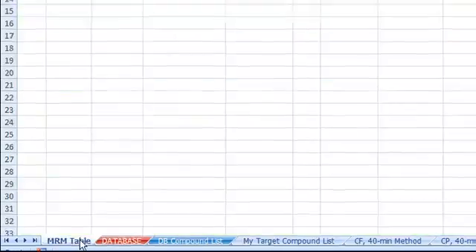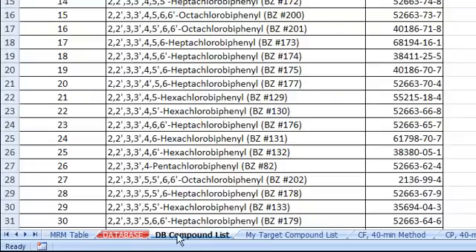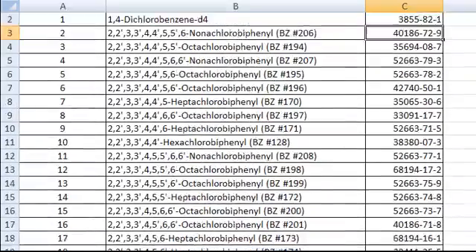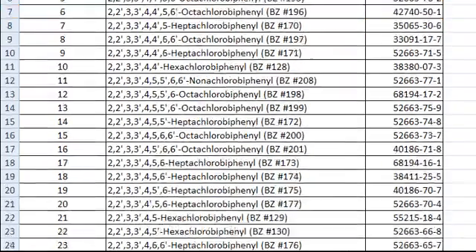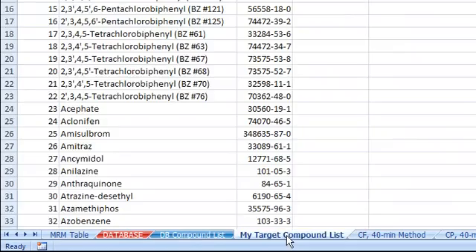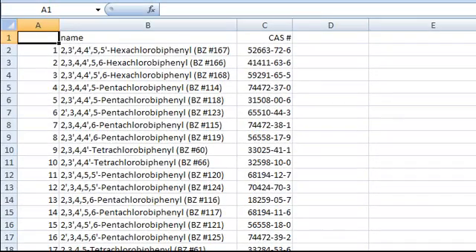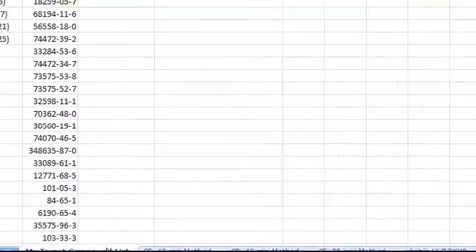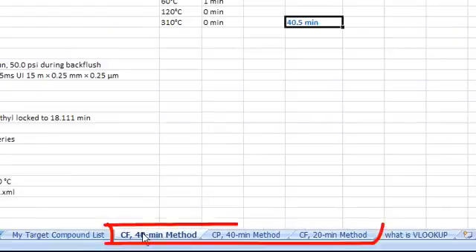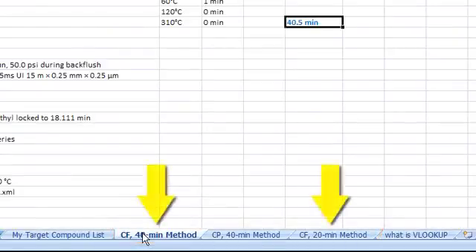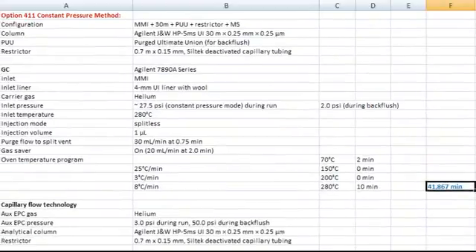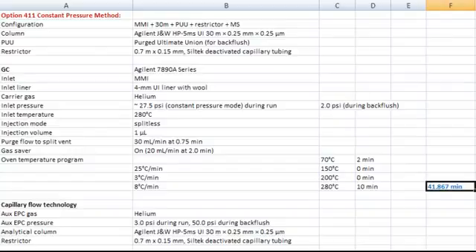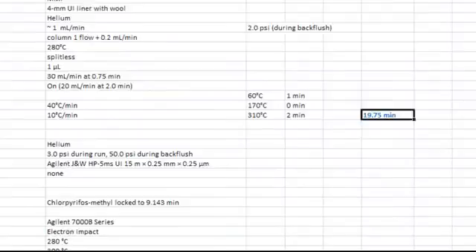MRM table is used to build the MRM acquisition method. Database compound list has all the names and CAS numbers of the compounds in this database. My target compound list is a list of compounds that you would like to build an acquisition method from. The next three tabs are three methods used in this database. Two constant flow methods and one constant pressure method. Each tab gives you the detail method parameters.